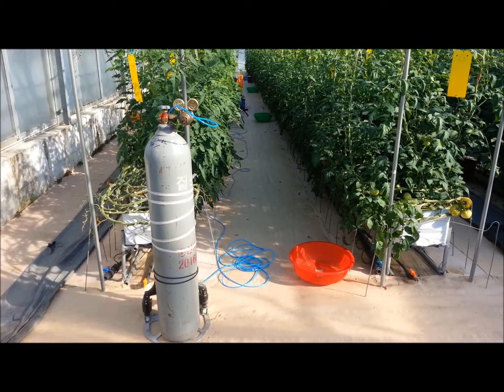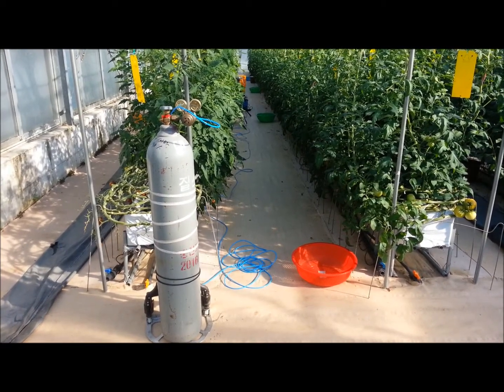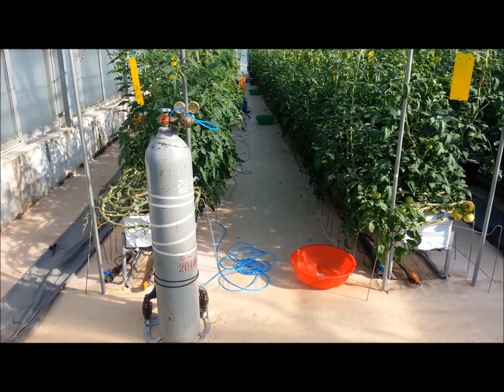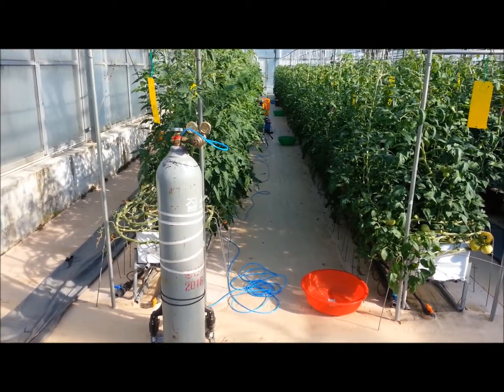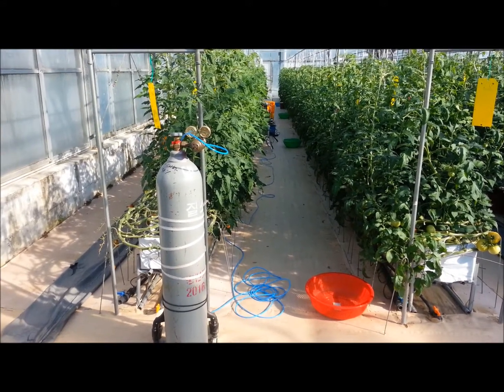2015 March 26. I'm Kang-ho Lee. Let me introduce my LiCor measuring system for non-photorespiration conditions.